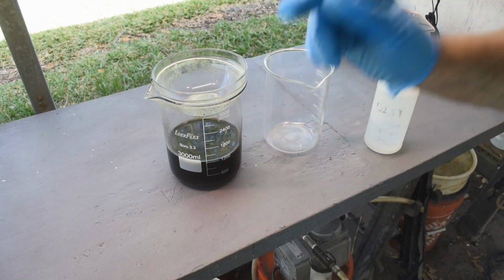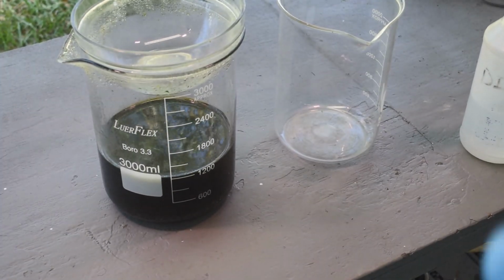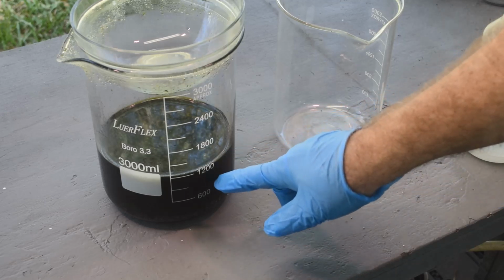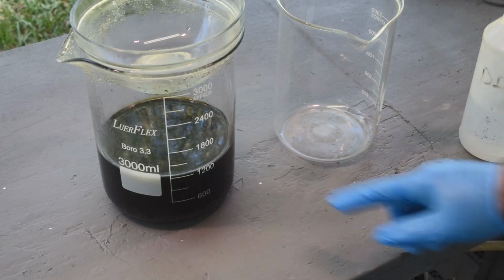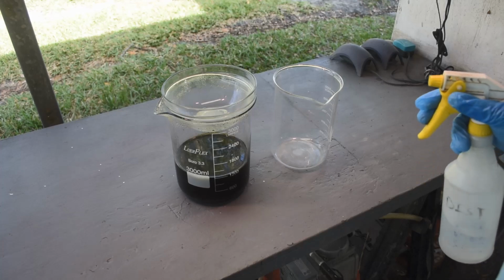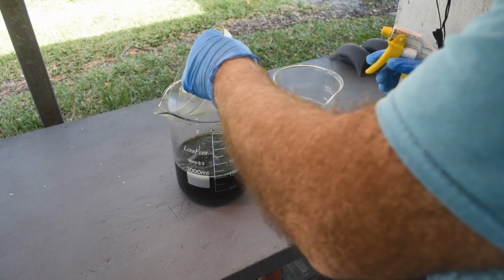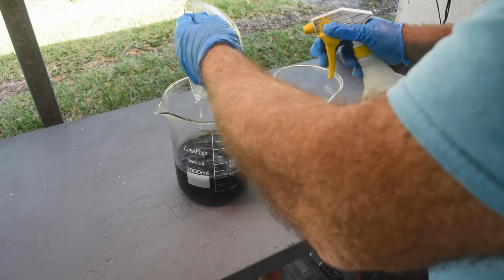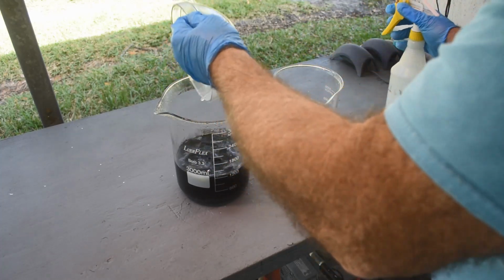Now, the observant among you, and some of you are very observant because you call me on this sort of thing all the time, will notice that there's more liquid in here than there was before. That's because off camera, I was busy with something else and didn't feel like setting up the camera and recording it. The reaction started slowing down at one point yesterday, so I put some more hydrochloric acid on it just to keep good times rolling. So we're up to about 1,200 milliliters of acid on there. So that's why there's a little more liquid here than there was yesterday when we started out. I think it was also evaporating down some, so I freshened it up a bit with some more.